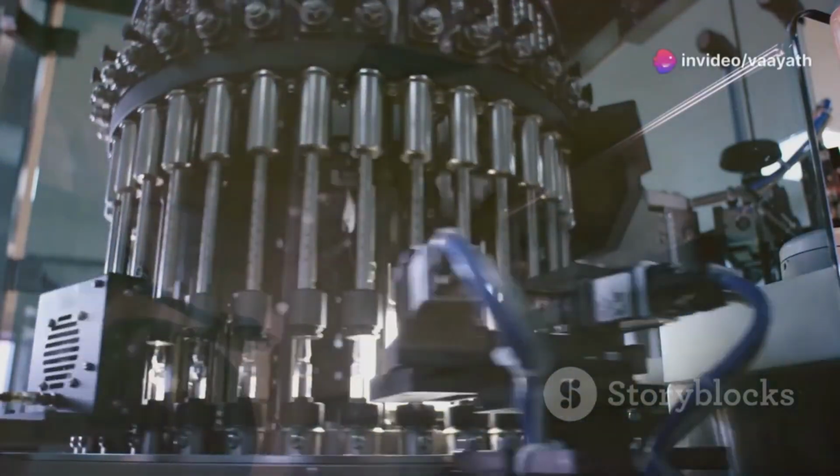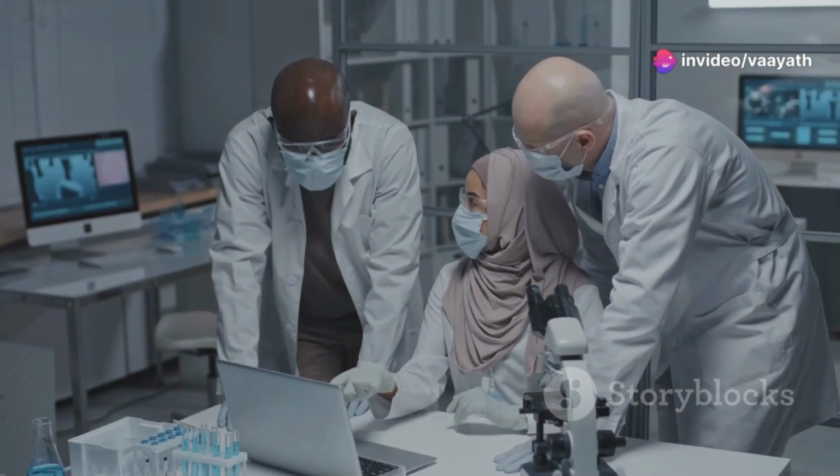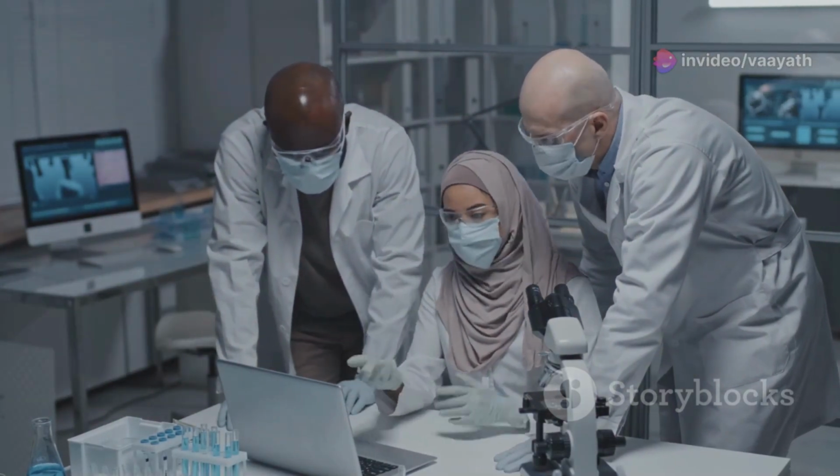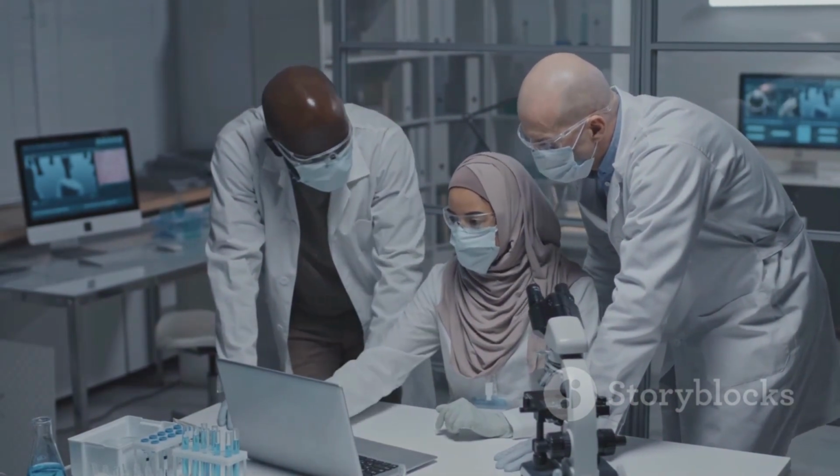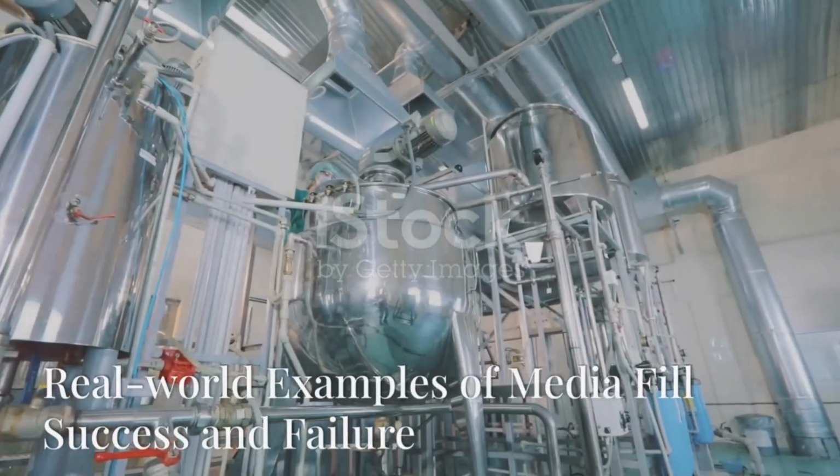Quality assurance oversees the entire process, ensuring adherence to protocols and regulatory standards. This collaborative effort ensures that the media fill study is comprehensive, accurate, and truly reflects the sterility assurance of the manufacturing process.